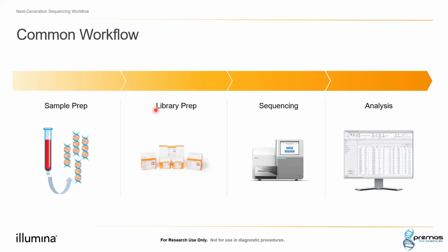Now, let's understand what is library prep. Basically, library prep, in simple words, is making your nucleic acids compatible with sequencing. The nucleic acids cannot go directly onto the sequencing platform.